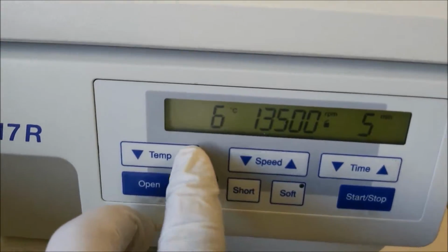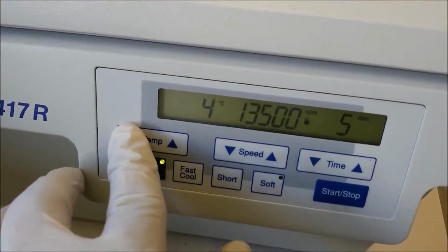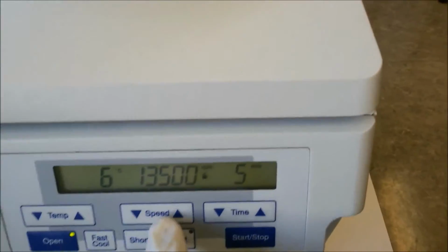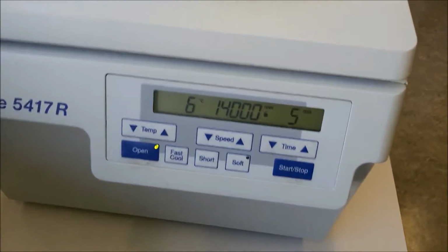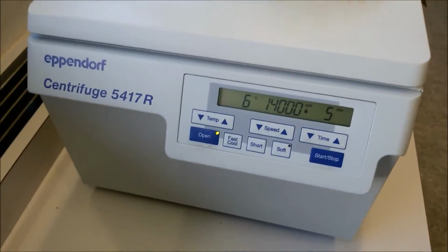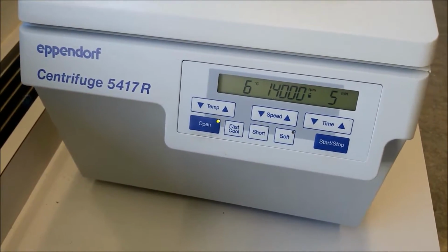You can set it 5, 6, 7, 8, 9. You can also go down to set it 0 degrees or whatever you prefer, -1, or you can set any temperature. And this centrifuge you can take to 14,000 RPM speed. That's quite a lot, and you can use any time. So these are called tabletop centrifuges, but with a temperature regulation.